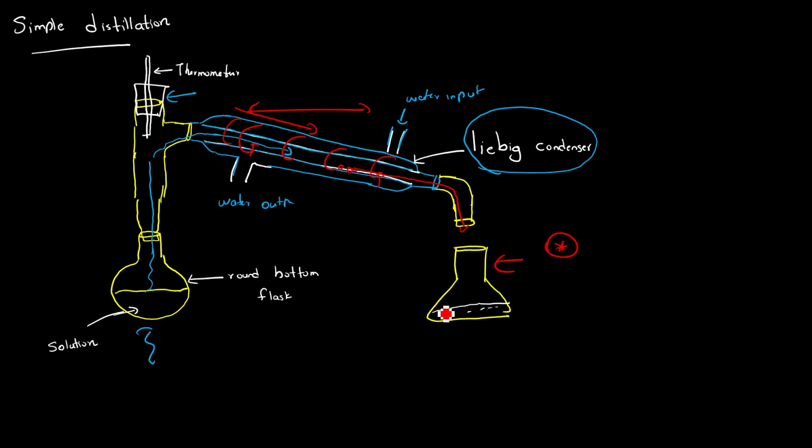There should be a considerable angle in order to pull out your extracted solvent. And the other thing is you need to seal off these edges, especially these joints. You can use things like grease or oils to seal off these edges, otherwise your vapor will leak out, and then finally the yield will be lower. So such things must be considered when it comes to simple distillation.